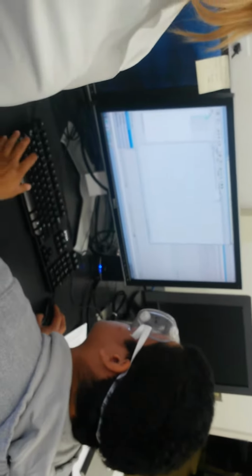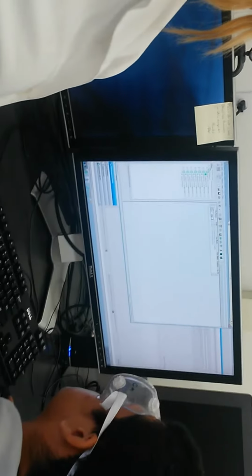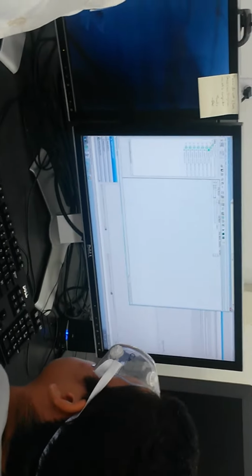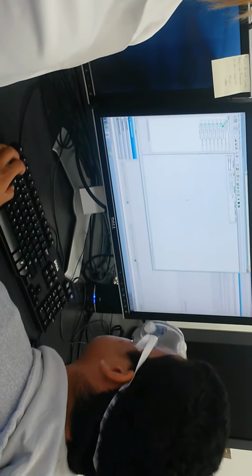What's the thing? Why is this deleted? Isn't it supposed to be clean? I'm deleting them at the end. Oh, okay. I see. We do that twice, right? Yes.